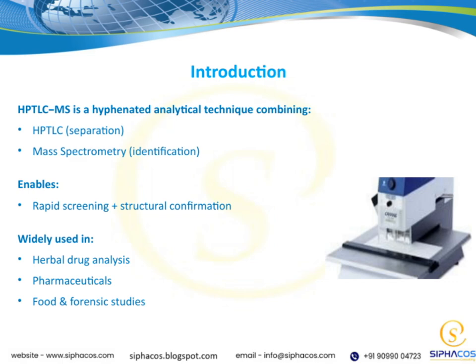This combination allows us to not only quickly separate complex mixtures, but also to confidently identify the compounds involved. That's what makes HPTLC-MS especially valuable. It enables rapid screening of samples and provides structural confirmation of the compounds we're analyzing.